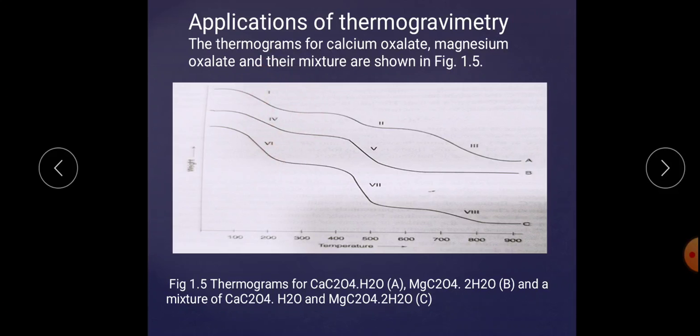Above 250 degrees Celsius and up to 400 degrees Celsius, there is no weight loss. So it is a plateau.